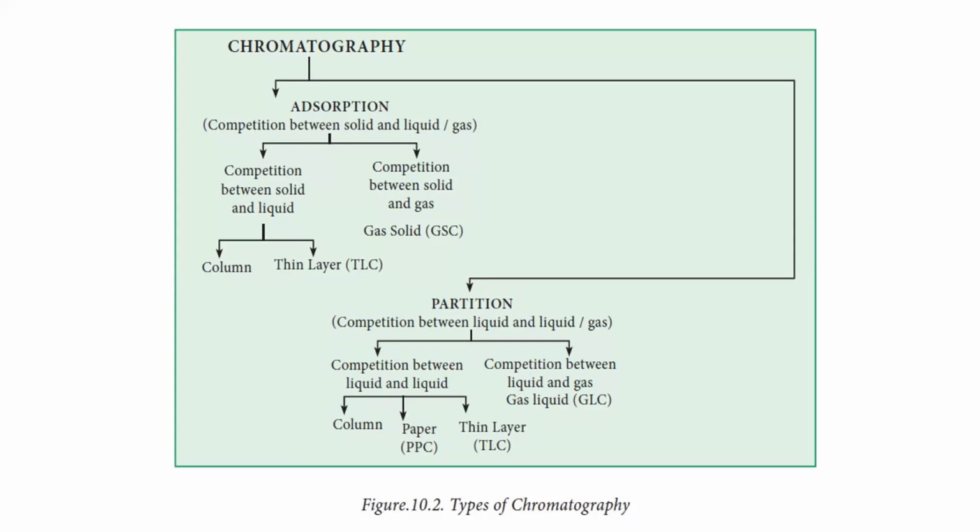So proceeding further, this time we are going to see ion exchange chromatography, we are going to see gel permeation, which is also known as size exclusion. And then there is one more, affinity chromatography. So we are going to see these three chromatography techniques, and this is a schematic representation. The adsorption part, we are also going to discuss after we finish today's three chromatography techniques. In the next class, we're going to see adsorption chromatography.